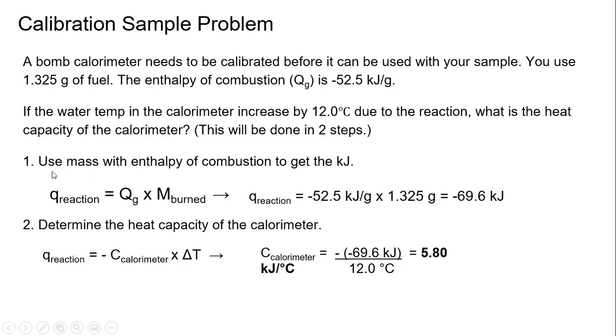The first thing, and by the time you get done watching this video, hopefully you'll understand the steps that are involved, plus reading the PDF. You need the mass. You have a mass here, and you're going to need the enthalpy of combustion because we need to get Q. We need to get the Q of the reaction.